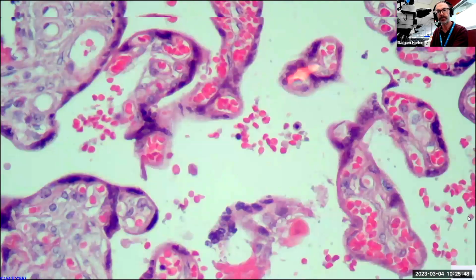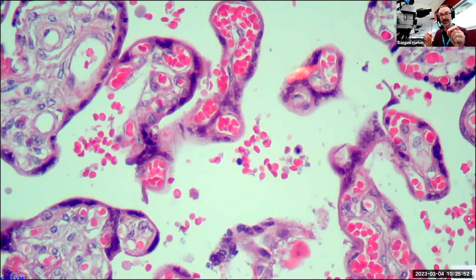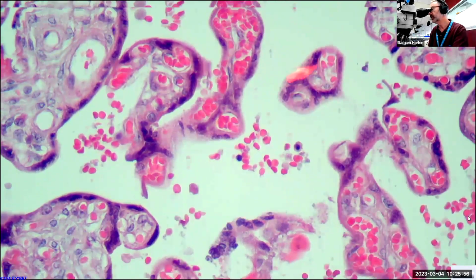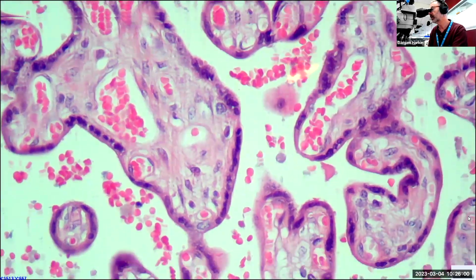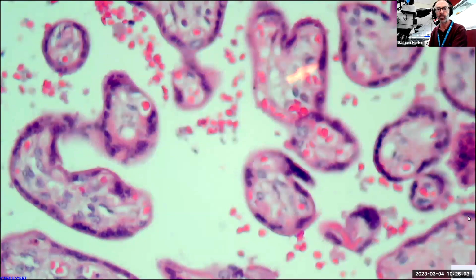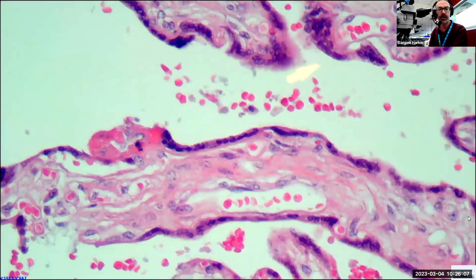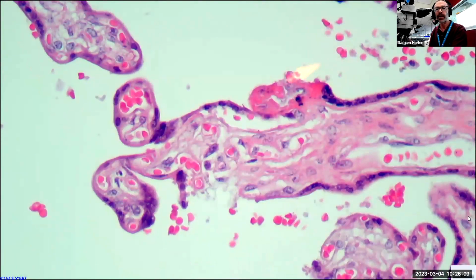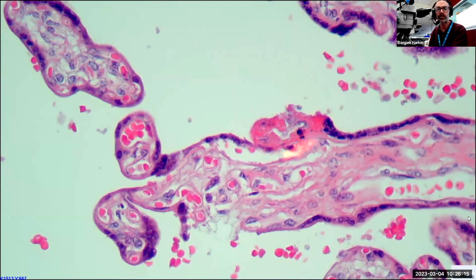So just a quick tip for you there, you do need to use the alcoholic version of a saturated solution of picric acid. Now, it's kind of hard for me to show you where it was and where it's gone from, because what we see now is little to no signs of any of that black material that we saw before. So if I scan around a few areas here, I'll try to convince you that it's no longer there. There's a little bit of something there, which could potentially be a bit left over, although it could just be a bit of hematoxylin as well.